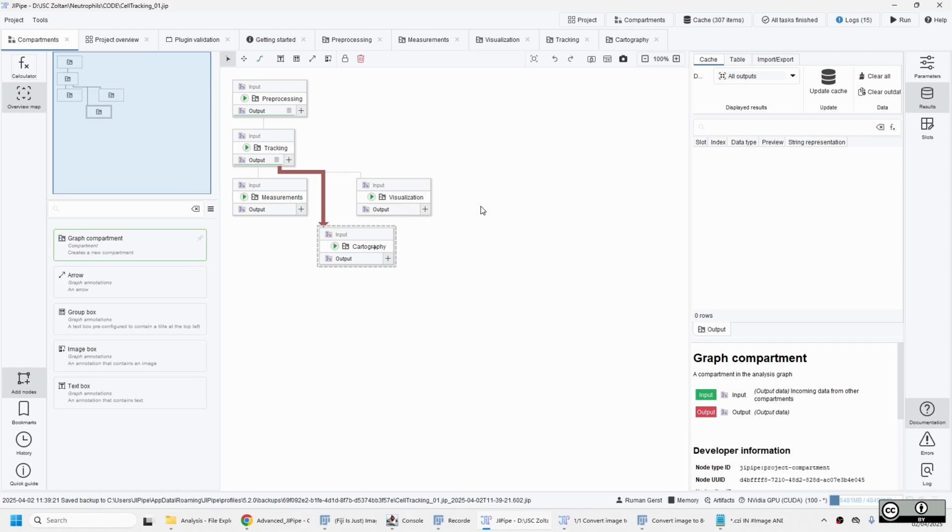Now, if you imagine having to do this as an ImageJ macro, I had such a macro. That was one of the first things I did when I moved here. It had 3,000 or 4,000 lines of macro code. And it found macrophages, it found pathogens, it measured the movement, all kinds of things. But can you imagine to maintain and to share 3,000 or 4,000 lines of macro code with people and to teach it at a class? This would not work because even I got lost eventually in that.